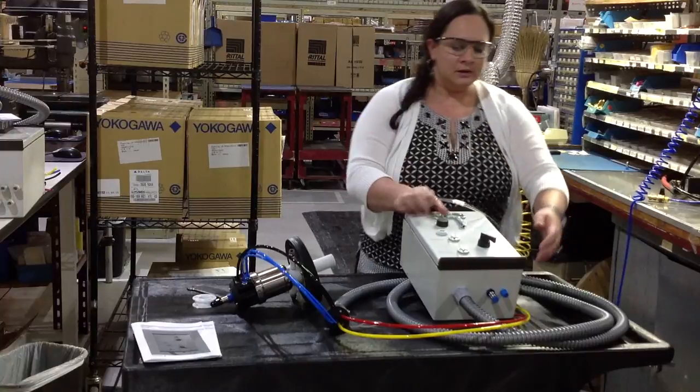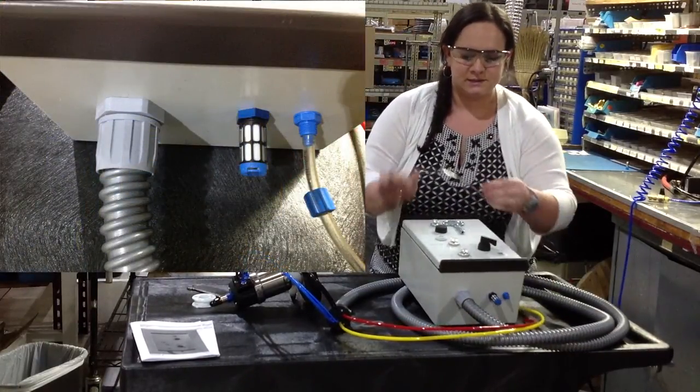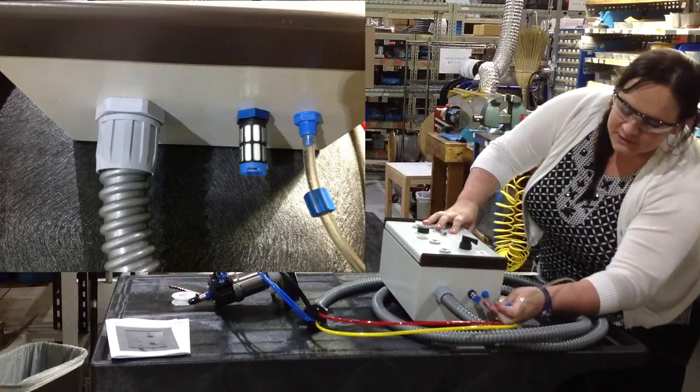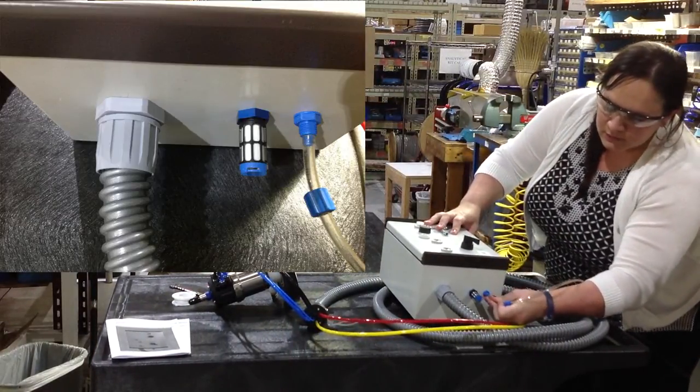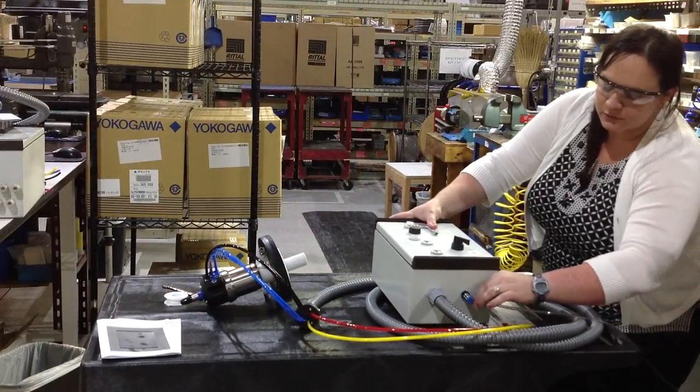The last thing you have to do is connect a quarter inch tubing for air pressure into the control unit, because you need the pressure in order to have it retract out of the process mode.